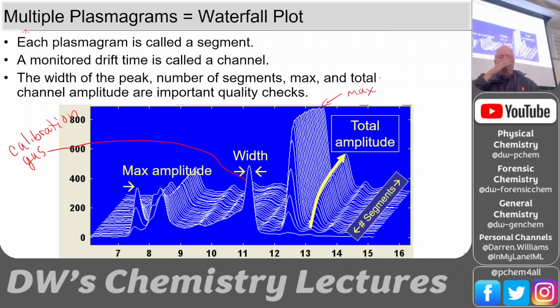And they've done standards. They know heroin and cocaine and TNT and nitroglycerin, all the different explosives and all the different drugs. The Coast Guard really developed this technique for detecting drugs on boats. They would board a boat, they'd swab all the different places, and they would run it on this very quickly to see if they had probable cause to search the vehicle or the vessel. And so they had it tuned for drugs.